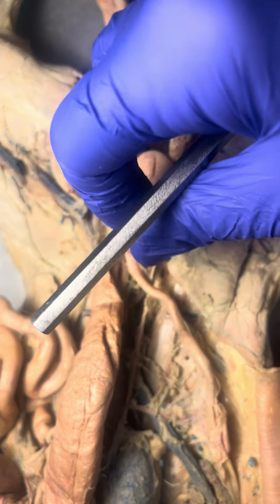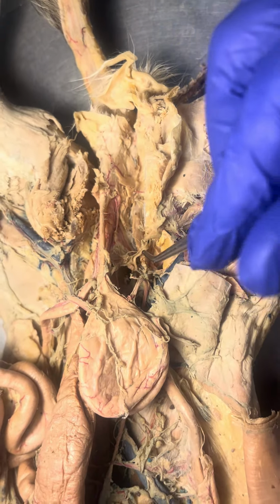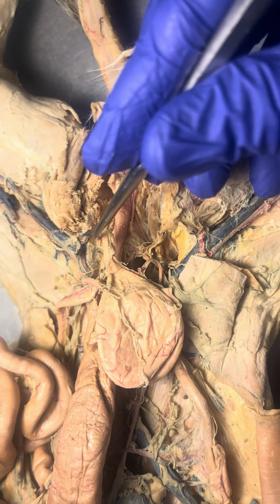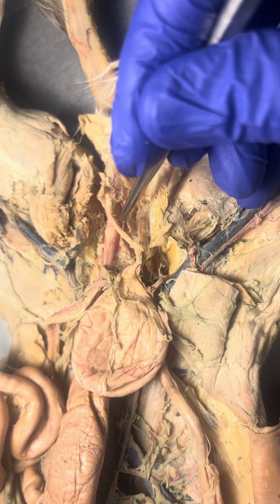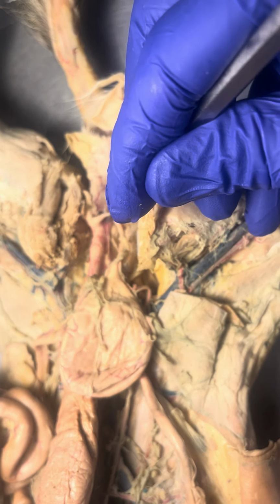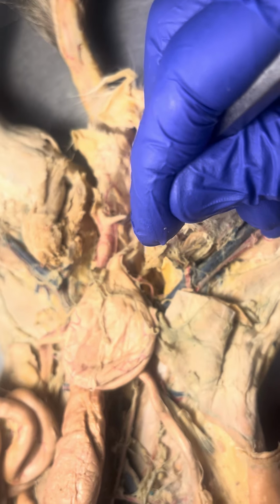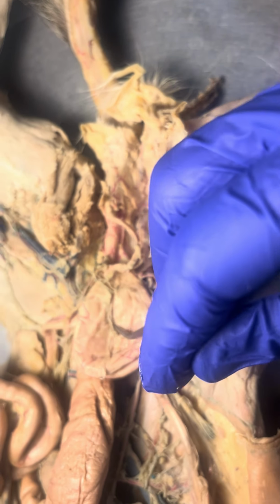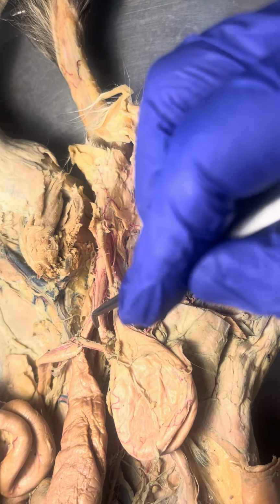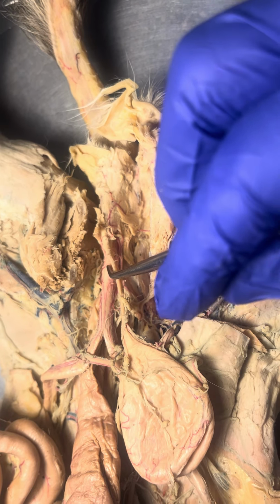And now, so that's the bladder with the 2 ureters going in and the urethra coming out. Here's the urethra. And now the tube behind the bladder is the vagina. Way down here near the exit from the body, it's the vagina. And then I can see this thickening of it, and that thickening is the cervix. So I can see here this kind of white piece where the vagina thickens, that's the cervix.